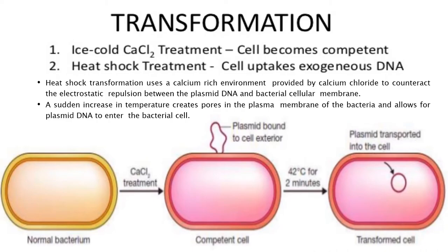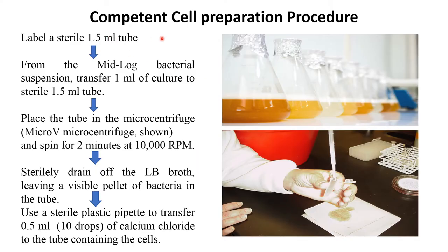Now for the competent cell preparation procedure. First, a sterile Eppendorf tube of 1.5 ml will be taken and labeled. Then from the mid-log bacterial suspension, transfer 1 ml of the culture into the sterile 1.5 ml tube. Place the tube in a microcentrifuge and spin for two minutes at 10,000 rpm.